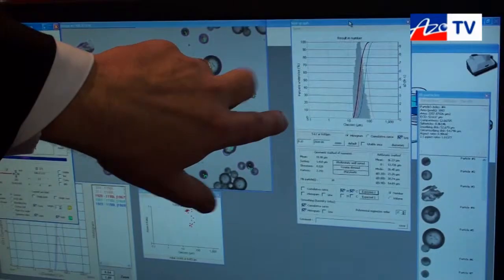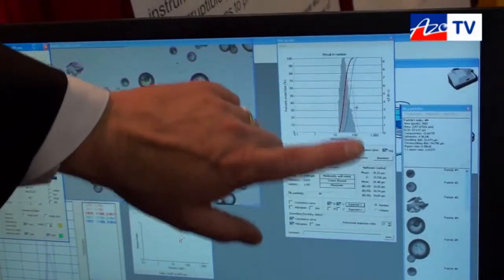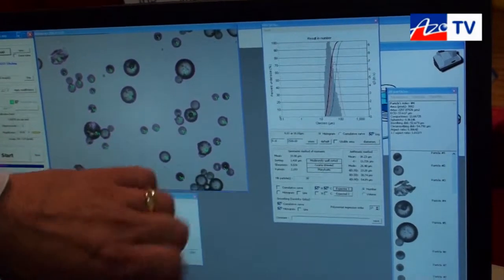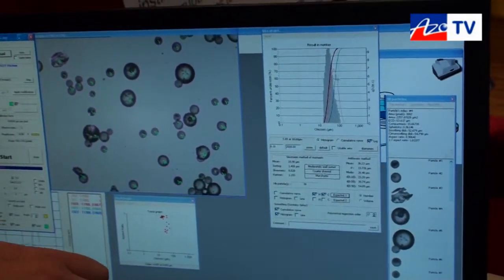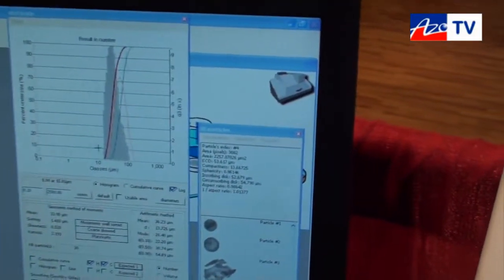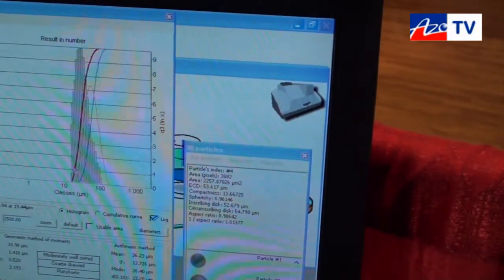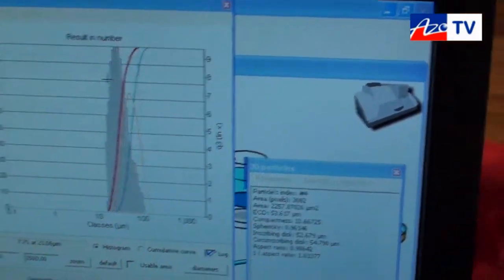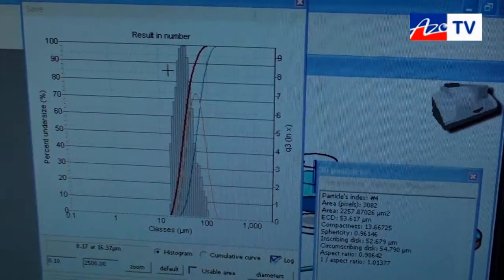We can also have data that we've input from the particle size analyzer, so laser diffraction data which might be difficult for you to see on the camera. It's a yellow distribution with a blue cumulative distribution and we can overlay that with the shape distribution which is the red cumulative data and the gray histogram. With that we can export the data to the particle size analyzer and overlay and compare the data or we can come from the particle size analyzer and go to the imaging.